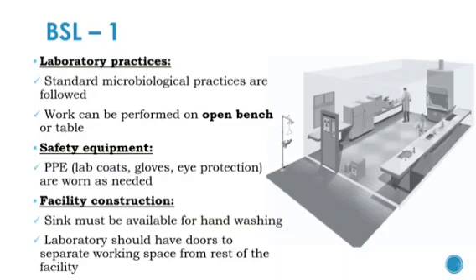The safety equipment required are personal protective equipment like lab coats, gloves, and eye protection, which are worn as needed. The facility construction. A sink must be available for hand washing, and the laboratory should have doors to separate the working space from the rest of the facility.